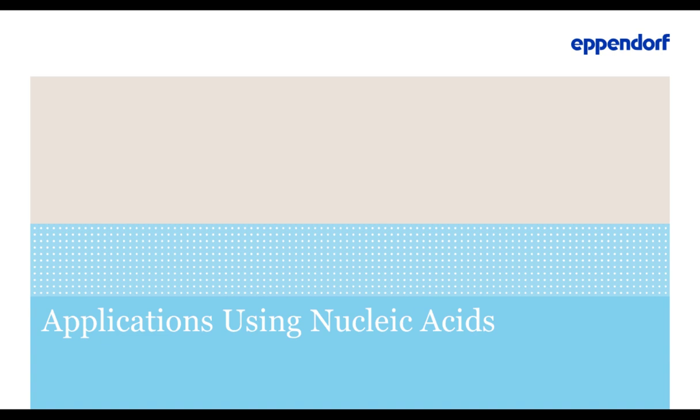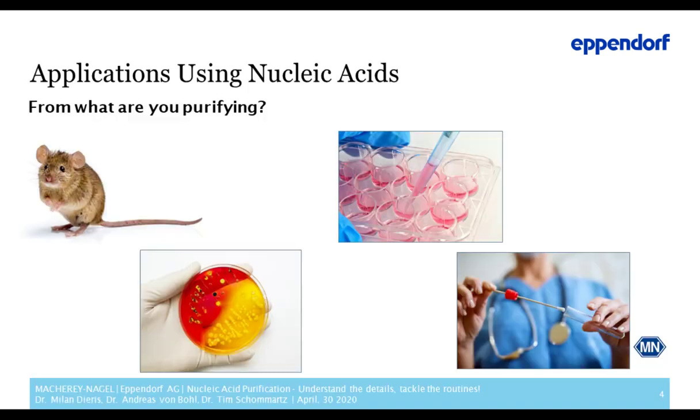So for the first part, I'm going to start with these basics. In this part, we're looking at a couple of important questions that you should have an answer to before establishing a purification workflow in general, regardless of whether it is an automated workflow or a manual workflow. There are a couple of questions that you should have answered before starting these workflows.